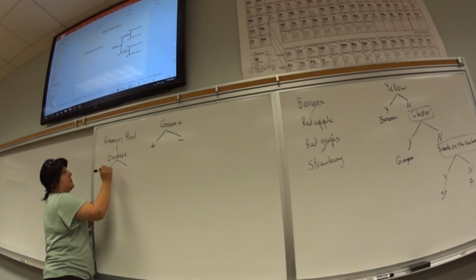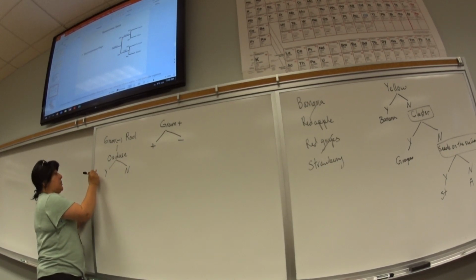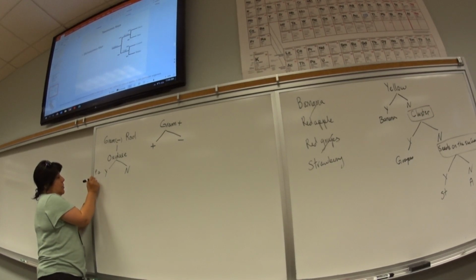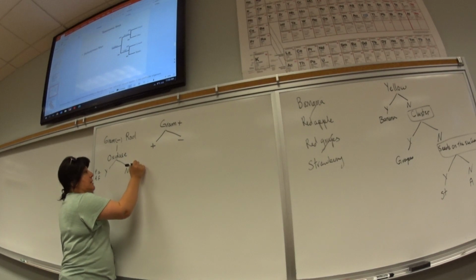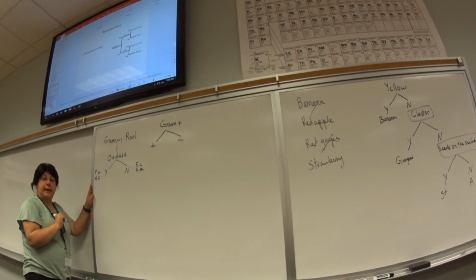Oxidase, did it have oxidase? Yes, no. If it is yes, it could be Pseudomonas aeruginosa, I'm not going to write the whole thing, or Alcaligenes faecalis, but you guys should be writing it. If it is no, it's E. coli, it's Enterobacter aerogenes, and so on and so forth, okay?